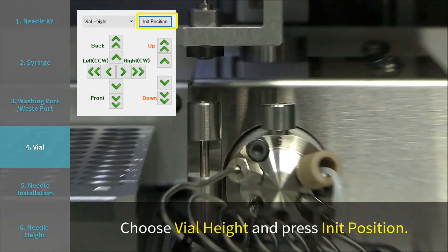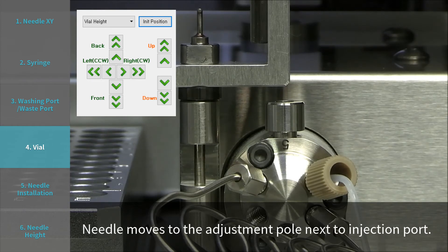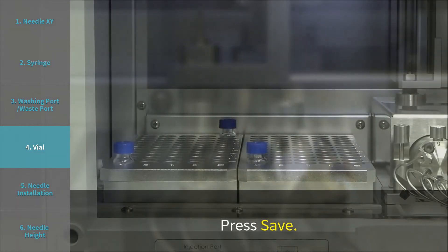Choose vial height and press INIT position. The needle moves to the adjustment pole next to the injection port. Move the needle down to the center position on the adjustment pole with up and down buttons. Press save.